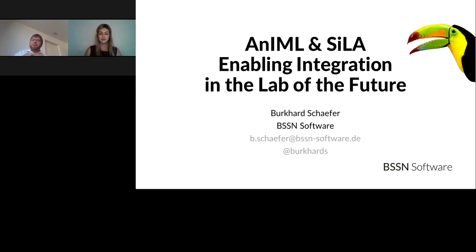But if your vendor doesn't do that, then there are still third-party tools that can do that. So at BSSN, we've written a library of about 150 of these to get the big things covered. We obviously hope that this will no longer be necessary in the future, that these things will come from the vendors. But if the vendor doesn't provide them, you can go to a third party, or you can even build it yourself. It's just XML.